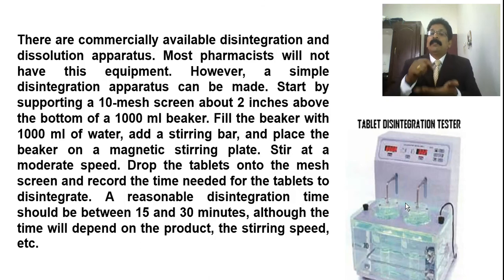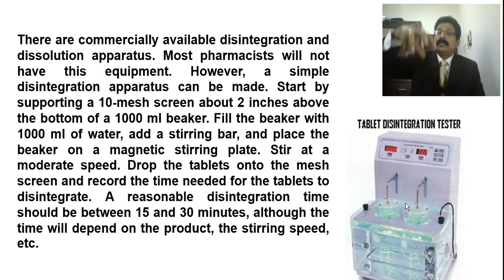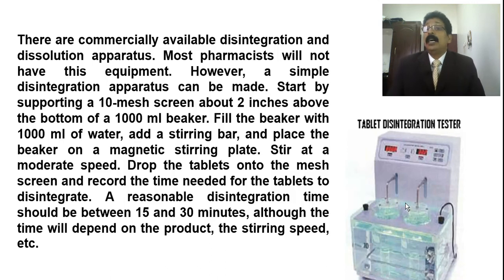That type of 10 mesh will be kept, and the tablet will be kept over it, and this cylindrical vessel will be moving through the 1000 ml beaker which contains the water bath, and the temperature will be maintained. By means of the up and down movement, you can cause even abrasion. You can keep some beads, or some plastic disc over the tablet, so that it moves in the water only and does not come outside the water. The distance will also be maintained, so that you get the disintegration time.